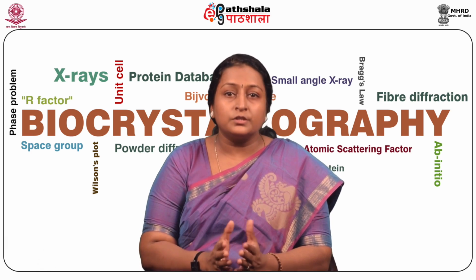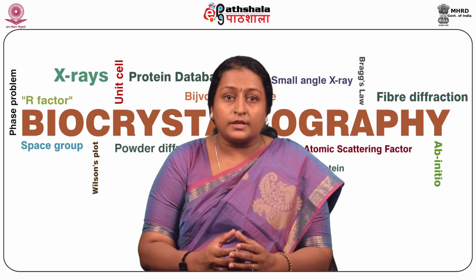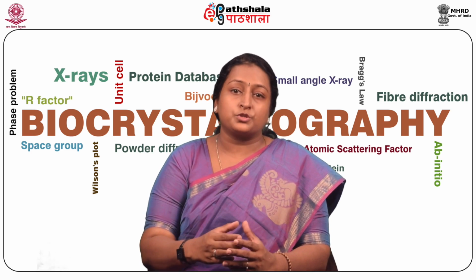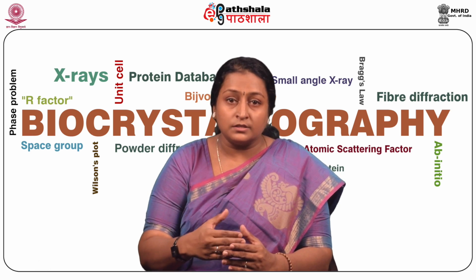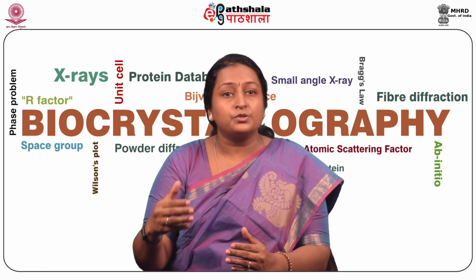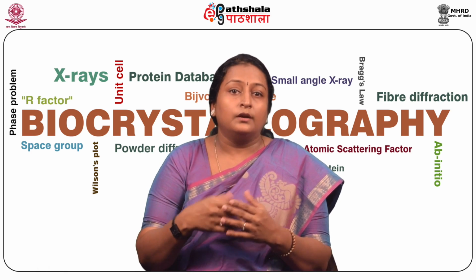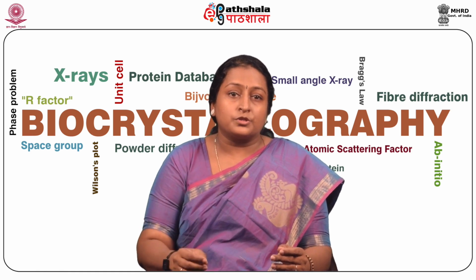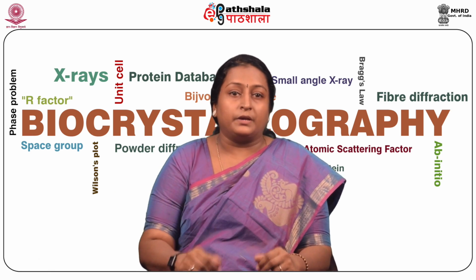Hugo Rietveld, who invented the method a few decades ago, used it to extract as much information as possible from a powder pattern. At the very beginning, this was mainly restricted to atomic positions from neutron diffraction patterns. There is much more information hidden in the powder pattern, which may be subjected to Rietveld refinement. Simultaneous Rietveld refinements of several data sets, for example, can be used for full texture analysis also. Fast detectors like image plate detectors, in combination with powerful microcomputers, reveal a new aspect of Rietveld refinement with time dependence.